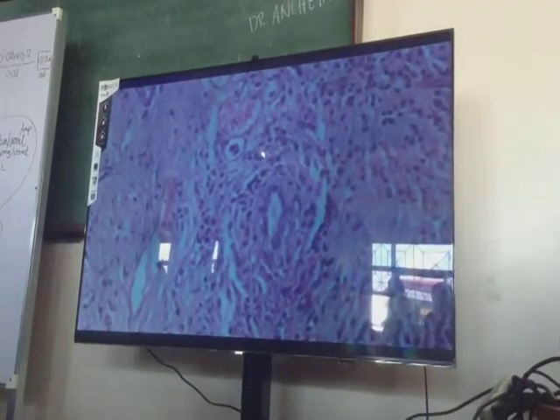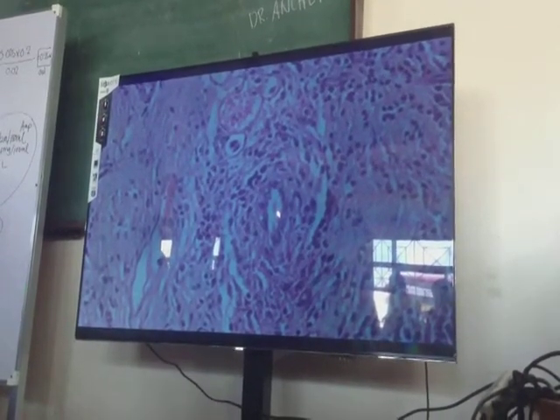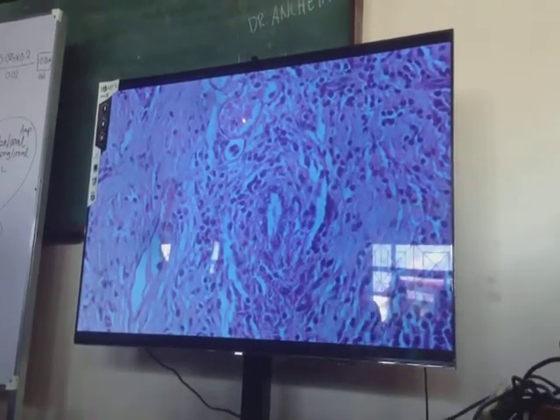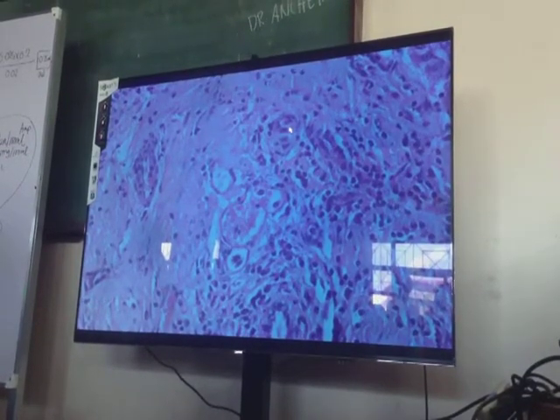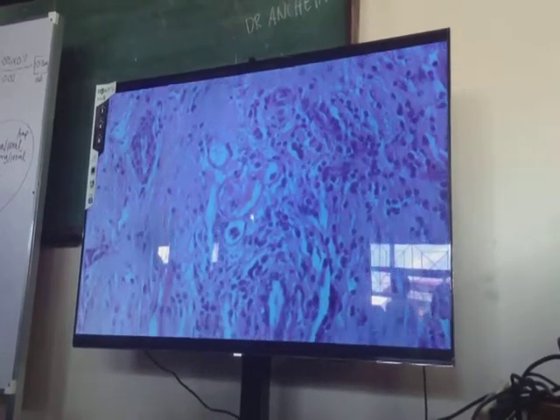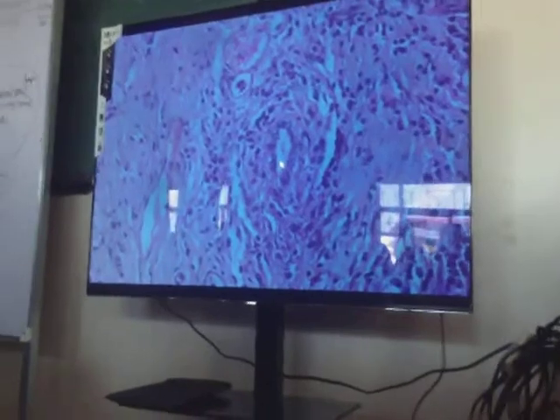Okay, let us examine this portal area. Okay, that is a portal vein, and then how should you call that pointed structure? Portal vein, and then the corresponding hepatic artery. Okay? Hepatic arteriole, portal venule, and then the third component of the portal area is bile duct.